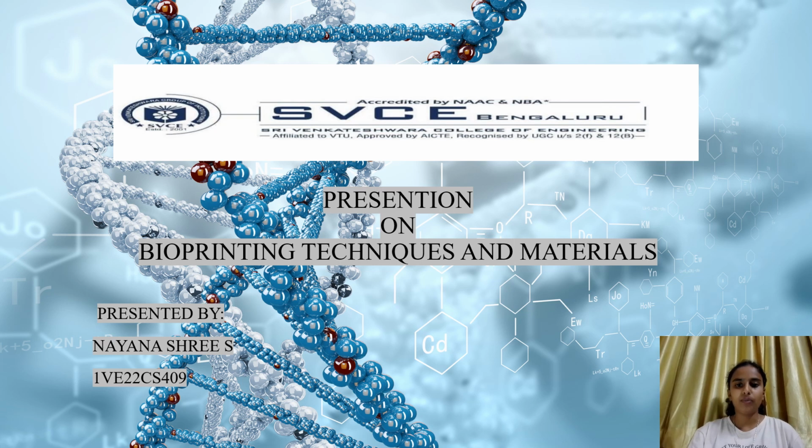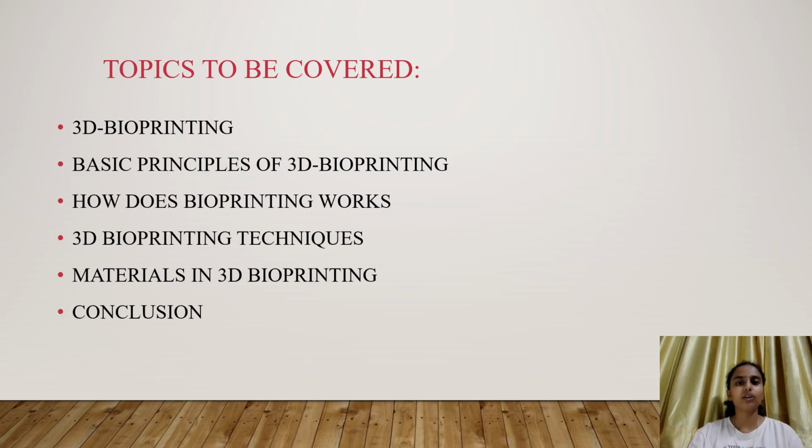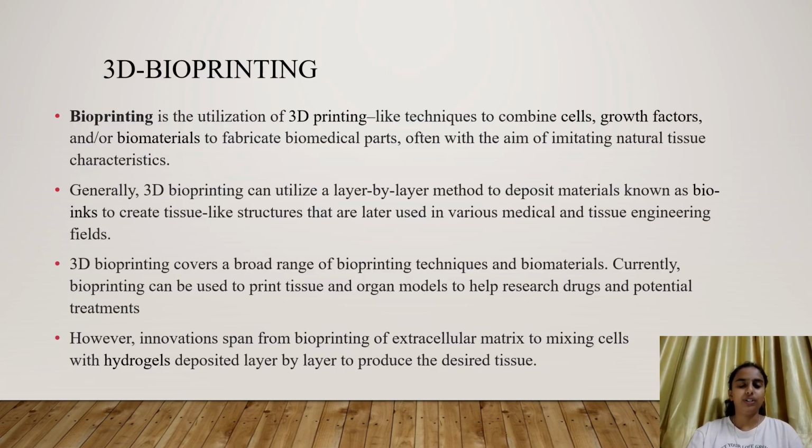In this video, I am going to explain about bioprinting techniques and materials. The topics to be covered are 3D bioprinting, basic principles of 3D bioprinting, how does bioprinting work, 3D bioprinting techniques, materials in 3D bioprinting, and conclusion. First, we can discuss 3D bioprinting.